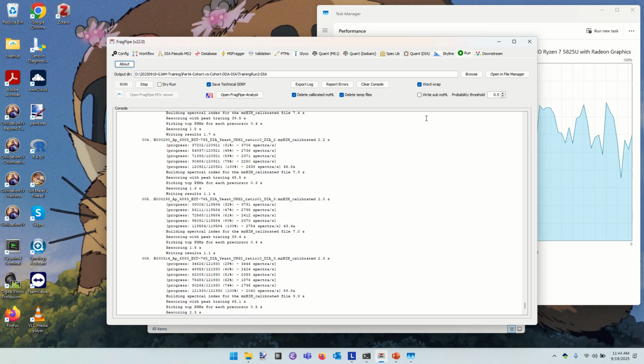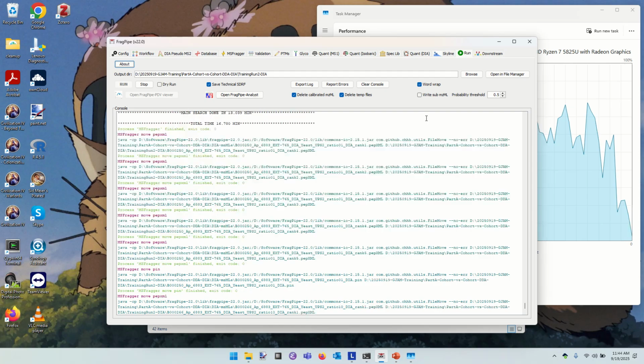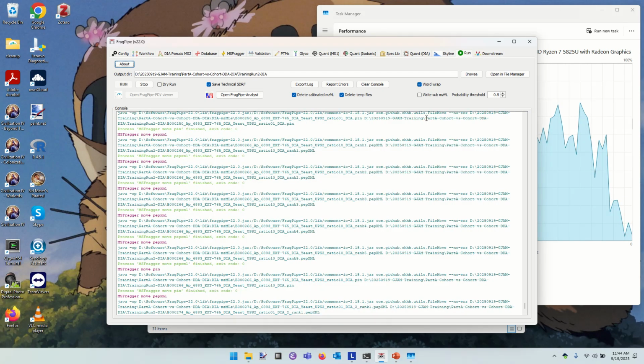I swear file 6 was taking much longer than I thought it should. All right, finally moving a bunch of files. The step of identification is complete.